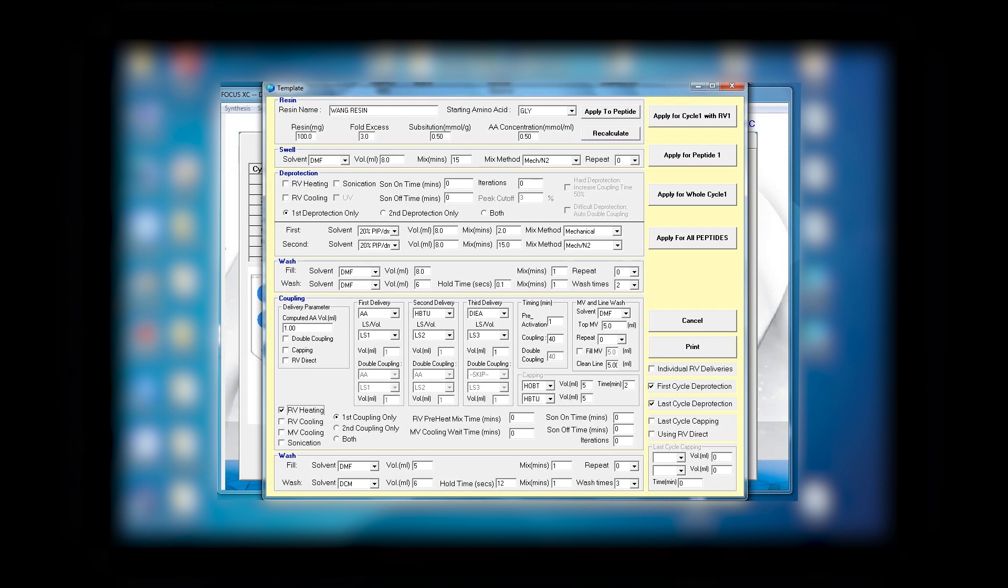So I remove the heating and will automatically have 40 or 30 minutes, if I change it, of mixing. For double coupling, if you have it, you can also change it to the time you would like to have.